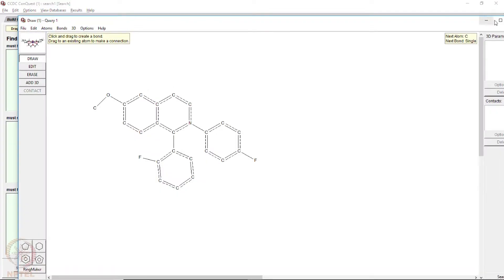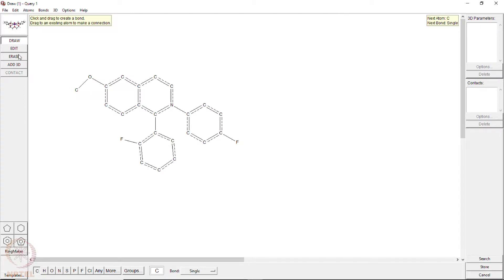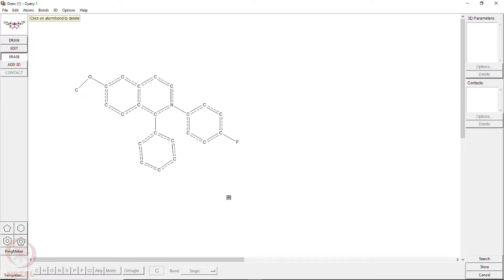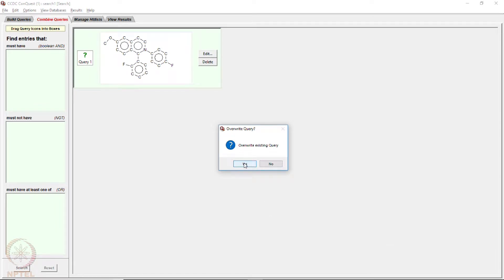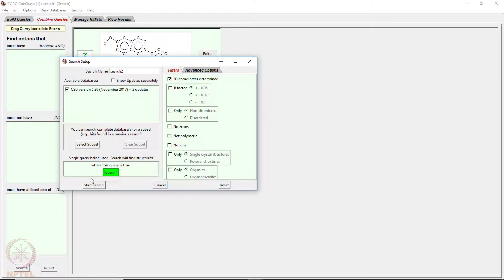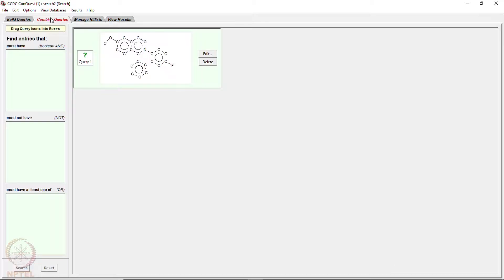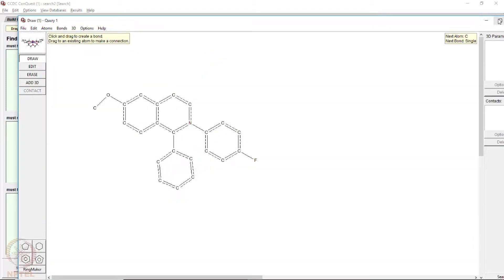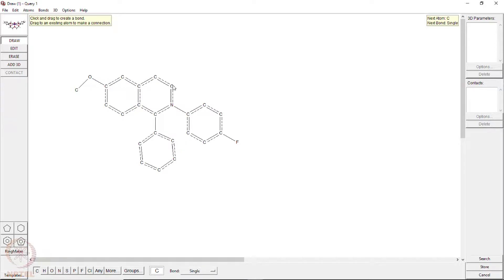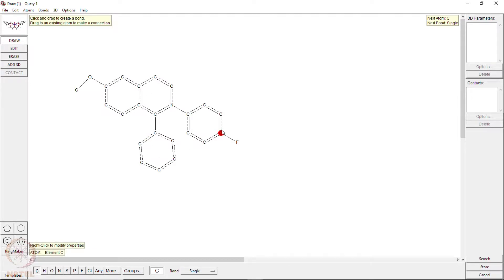Now if I remove one fluorine, I get a new molecule. I am overwriting the previous query. The search also returns nothing for that molecule. All the bonds drawn here are aromatic — so isoquinolines with all unsaturated bonds of this type are not reported.